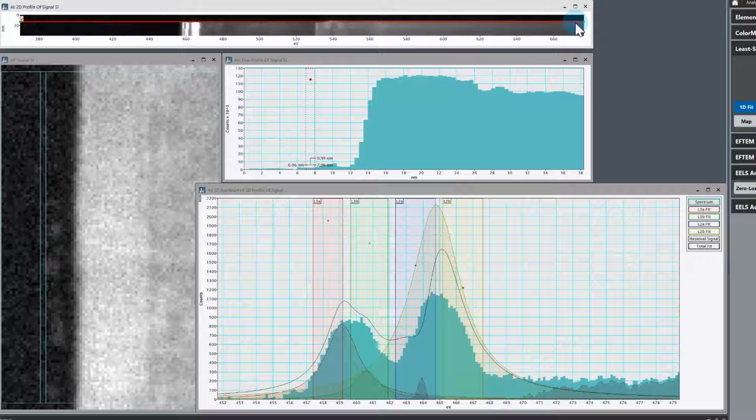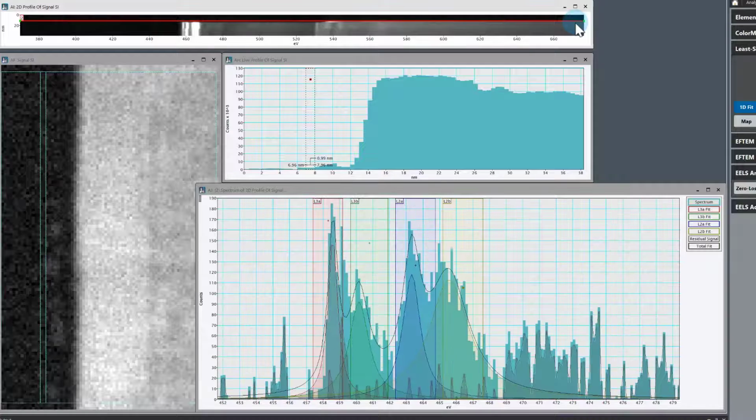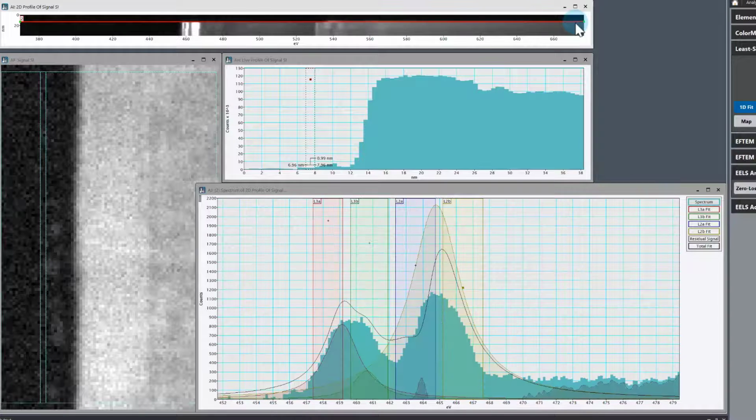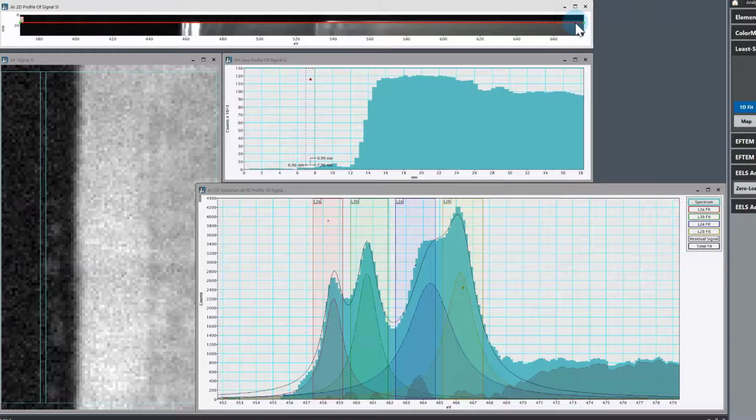You can see the fit there is completely nonsense, because we're in a region where we don't have the white lines at all. So this is a useful way of seeing which pixel was the first that we can confidently use. That one maybe is okay. Now this looks believable. There's a bit of a jump over here, so maybe that's not super trustworthy.